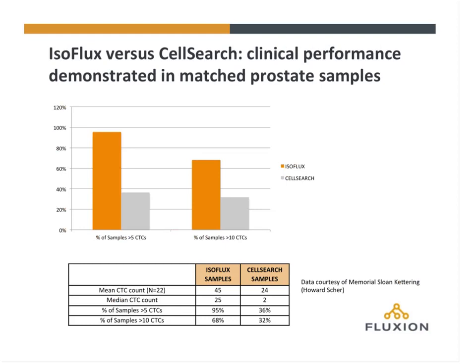And you'll see throughout this presentation, we tend to think of 5 CTCs as being a meaningful number, not so much for the prognostic indication like you might be familiar with on the CellSearch platform, but we've qualified several downstream assays that have 5 as sort of the lower limit of detection for the assay. So we think that if we can get 5 CTCs, we can perform a meaningful downstream assay on them.